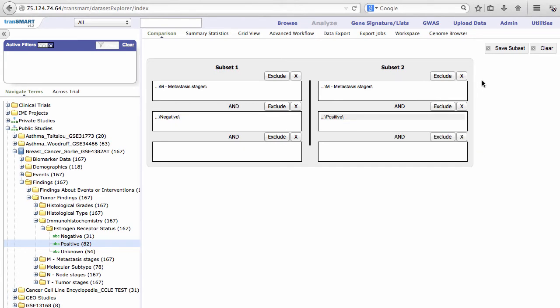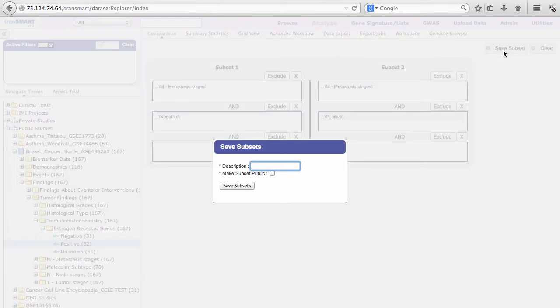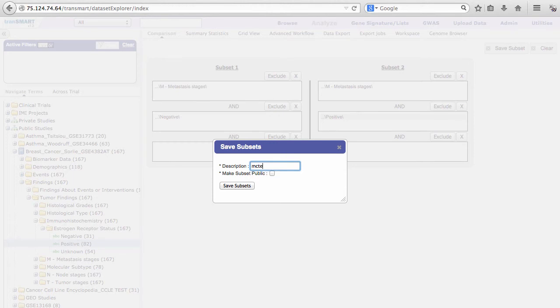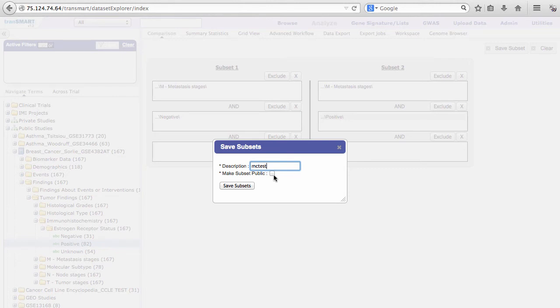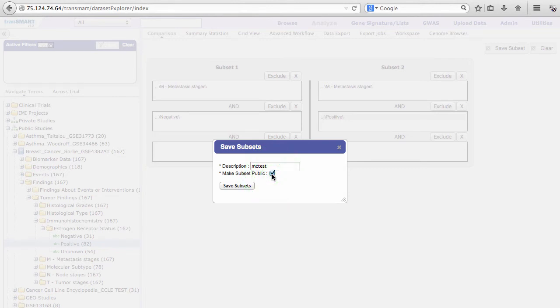Then click Save Subset. Give your subset a name. I will title mine MC Test. You can check the Make Subset Public box if you would like other users to be able to use your subset construction in their sessions. I will check this box for the purposes of this example. Now click Save Subsets.